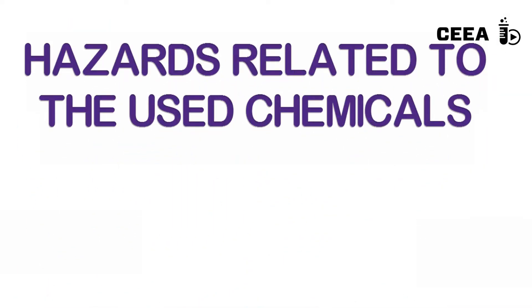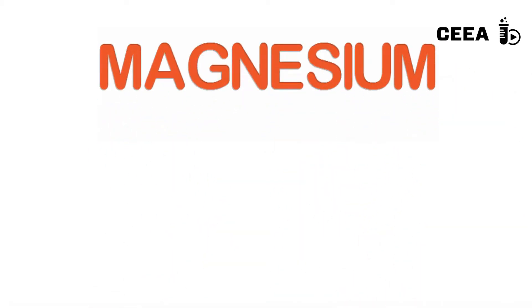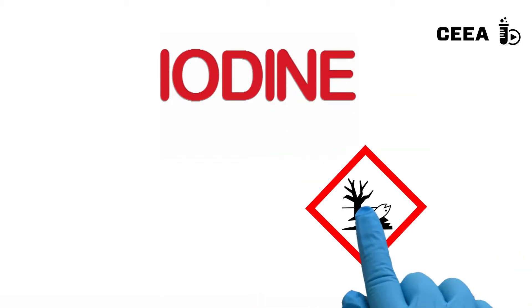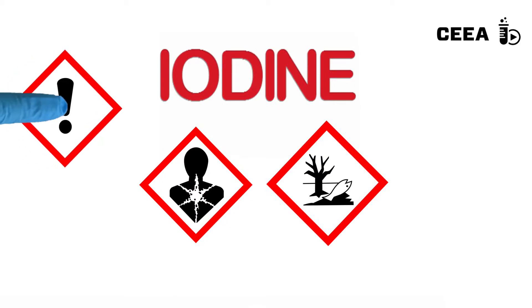The same safety measures have to be taken as in the previous experiment. Magnesium powder is highly flammable, iodine is irritant, caustic, and it harms the environment. Caution is needed as abundant iodine vapors will be generated during the reaction.